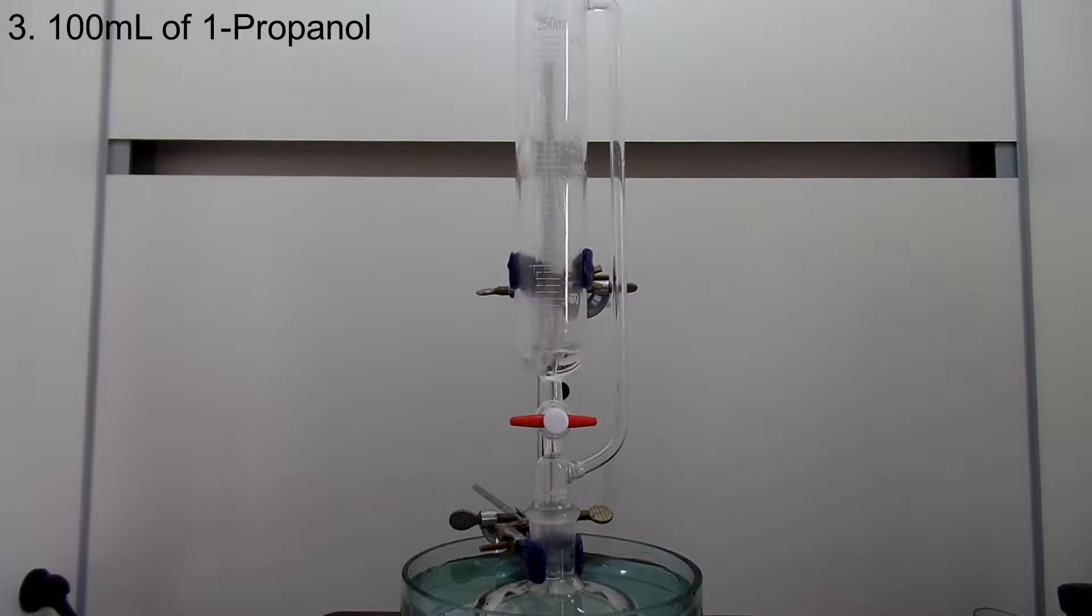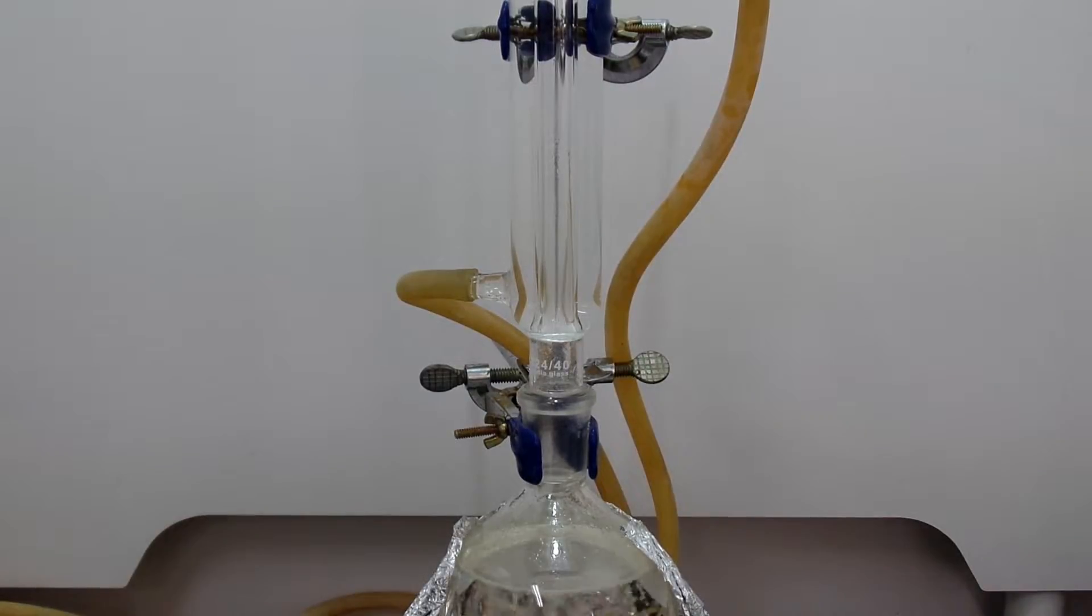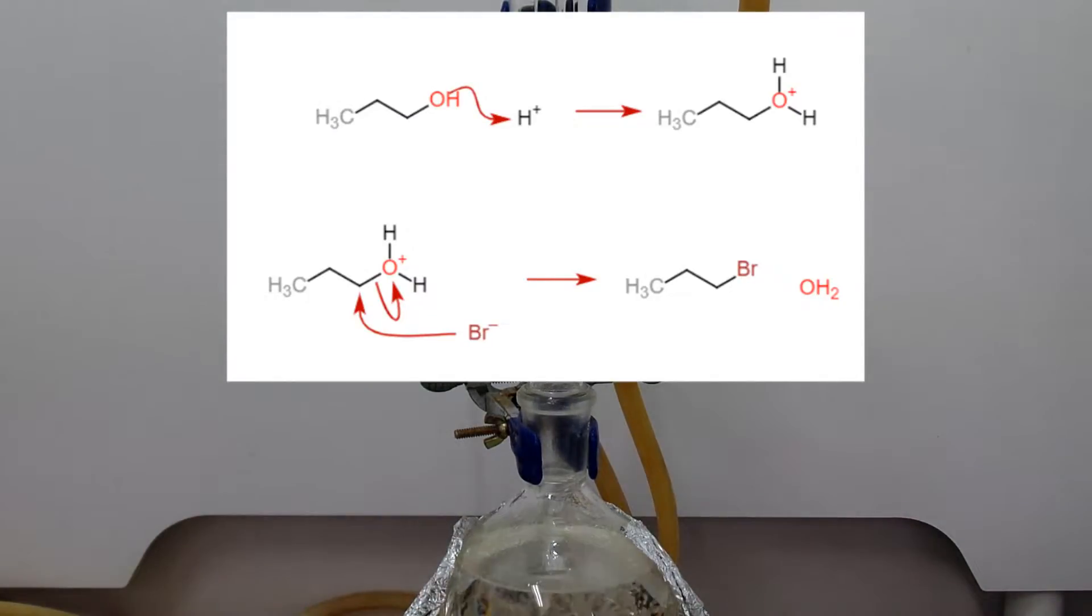After all the addition, add one propanol into the addition funnel and add it drop-wise. After all the addition, set up a reflux and the whole mixture is boiled for two hours. What we are doing here is we are brominating the alkyl group of the OH group of the one propanol. The reaction is shown above.